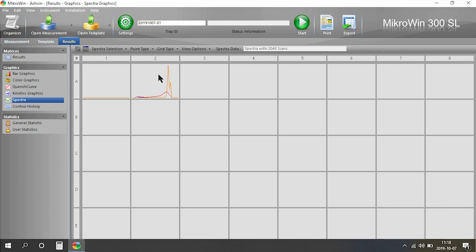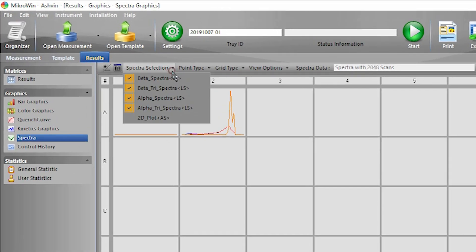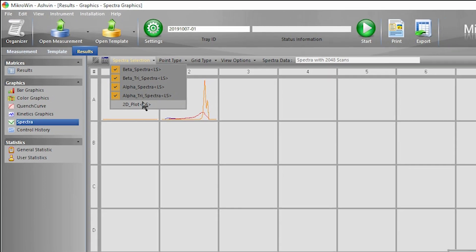If I go to Spectra selection, I can select my beta, beta triple, alpha, alpha triple, and 2D plot.